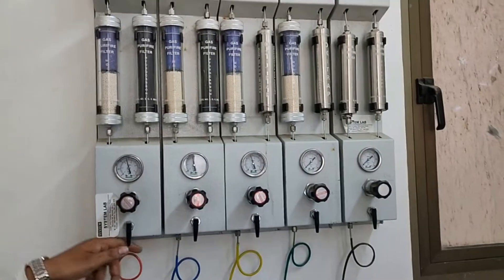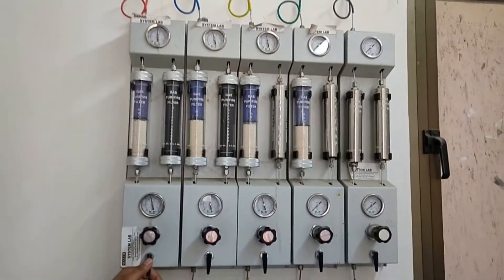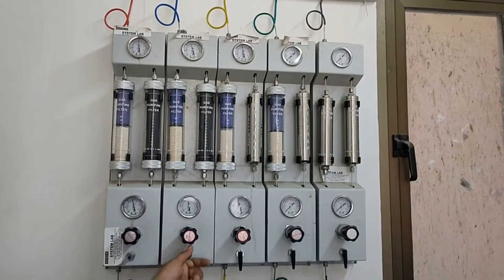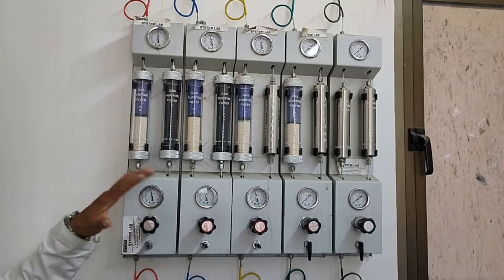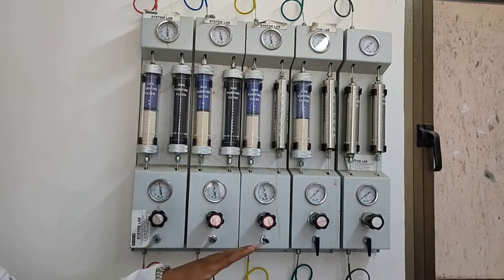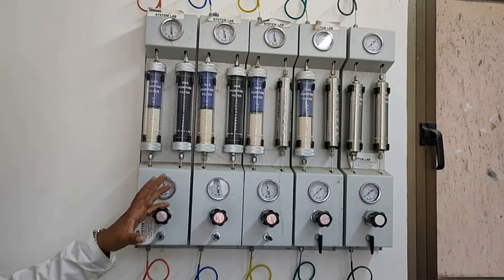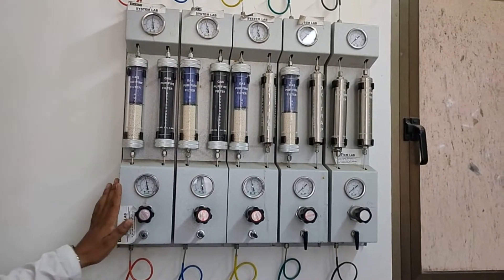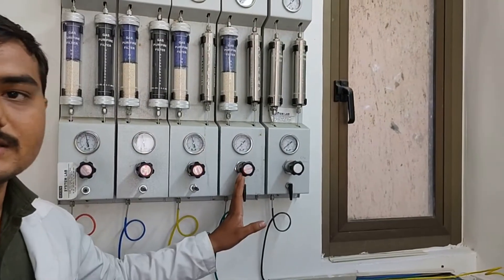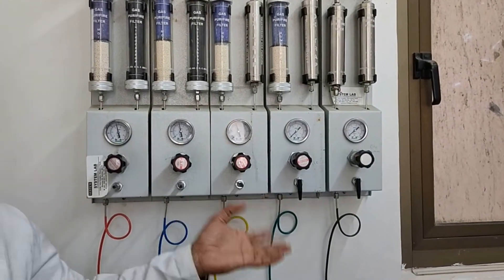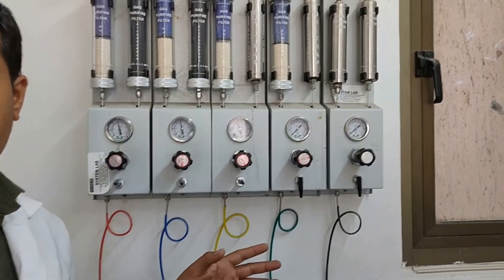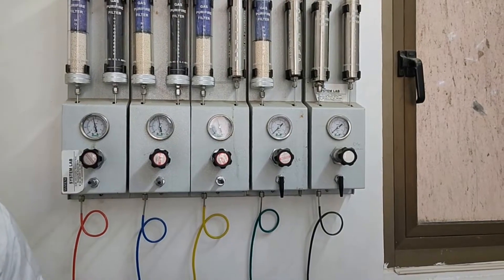Now come to the gas fuel. This is the gas regulator, just push on. So gas is starting up. Here the hydrogen, zero air, nitrogen, helium gases are using. For the hydrogen, the zero air must be required for the flame generation. Nitrogen and helium gases as the carrier gases. Carrier gases is useful for the transport of the compound sample from one place to another place.